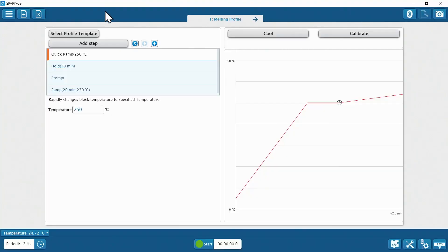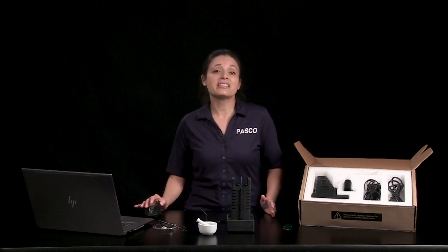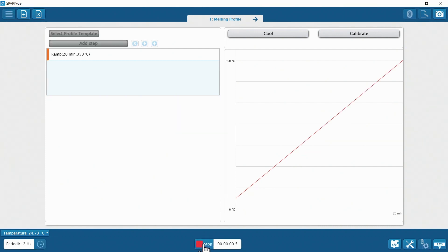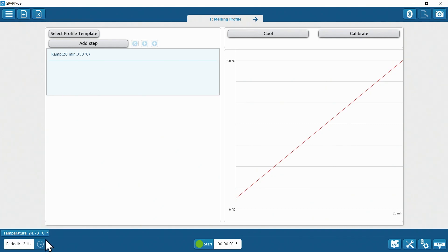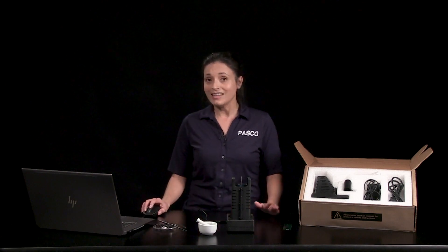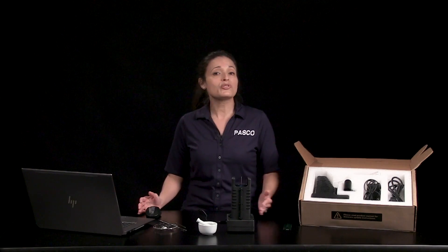For the ballpark run, I'll delete all the steps except for ramp and set the temperature to the maximum 350 degrees Celsius. That way I can watch the sample and jot down the temperatures where it looks like melting begins and ends, and I can stop the run as soon as melting is done and run the cool function. When cool is on, the fan runs at a higher speed and you can monitor your temperature to turn cool off when you're at least 20 degrees Celsius below the initial melting temperature.